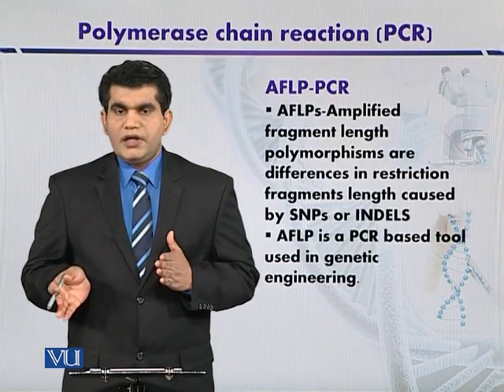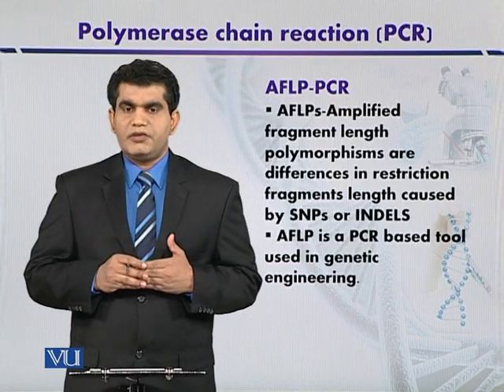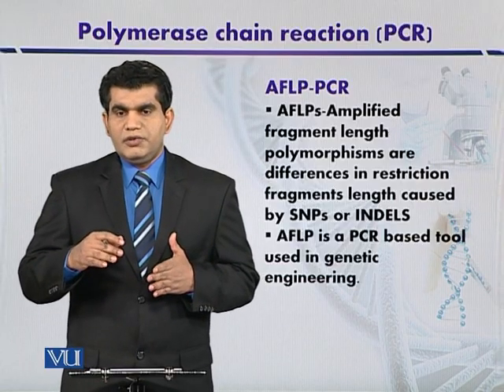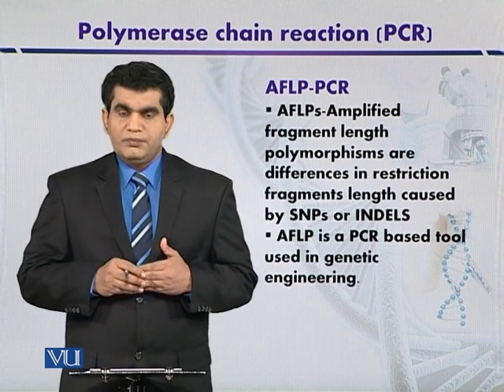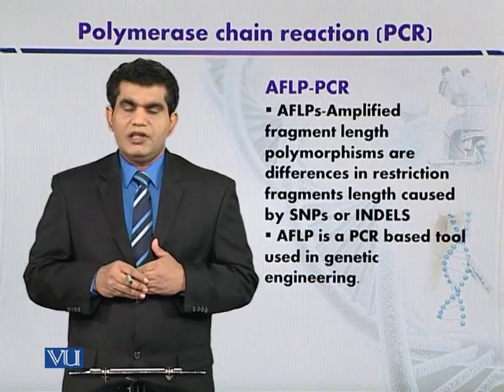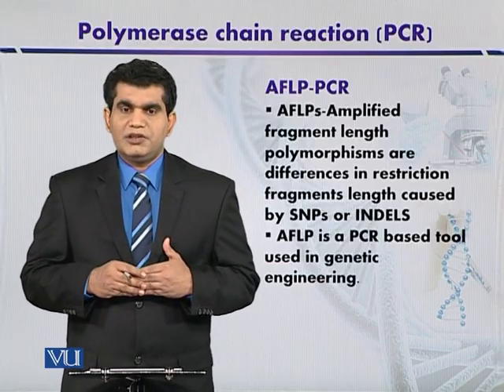So like the other two techniques, the same application is there, that it can also be used to find the relationships between different organisms, like genome mapping can be performed, and the relationship between different organisms can be elucidated, and disease linkage can be elucidated by using this technique. So when we compare it with RAPD or RFLP, the sensitivity is relatively high.